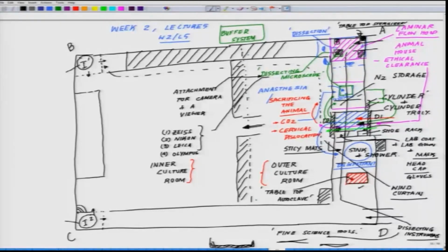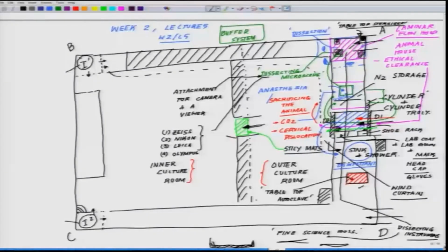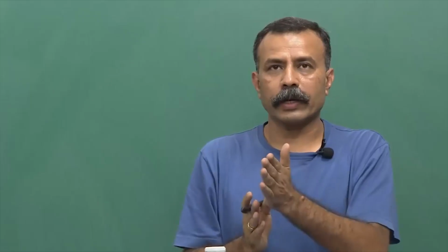Apart from it, out here, I'm using a light green color, from entering from this one to this part, because you have partitioned the room, you can put sticky mats, so that will provide a further level of checkpoint, or you could have a kind of sliding door out here which will restrict entry and exit along this point. Okay.